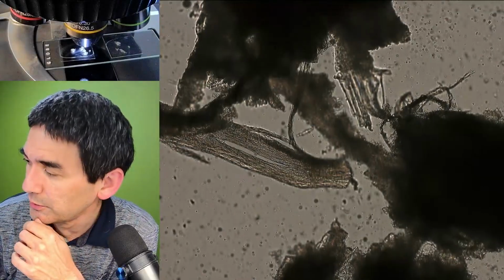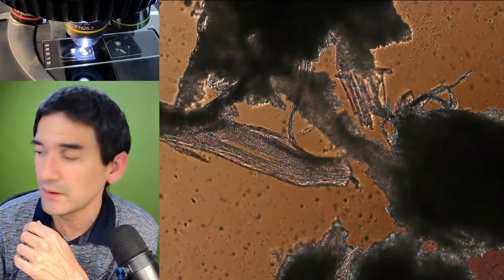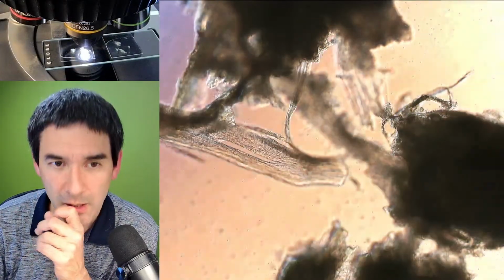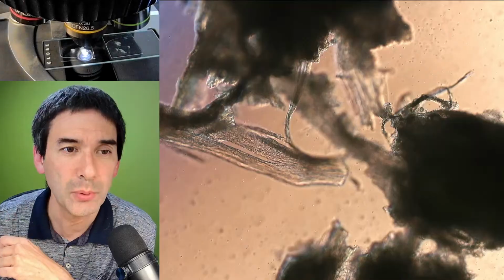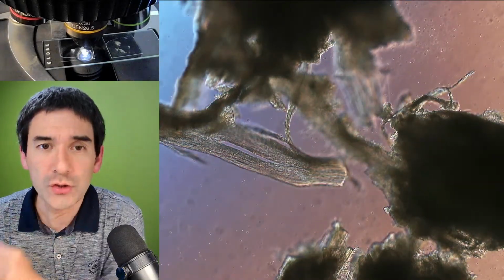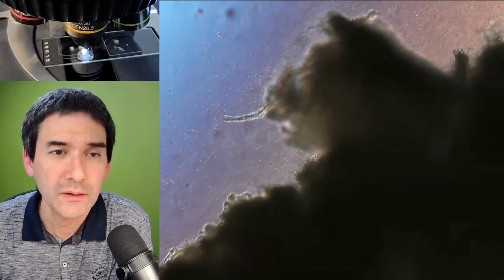So what we do is, if I use DIC, for example, then I actually have, let me put this back here. Now I'm using a little bit polarized light, and I can actually change the colors around here. Okay.